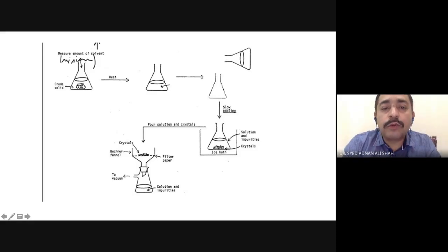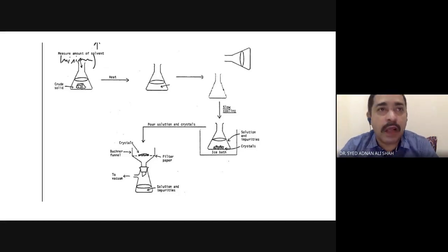So now this is how you can carry out the synthesis as well as the crystallization process, and the third one is recrystallization. Now the next step is to find out the yield, right? How much aspirin is formed from the salicylic acid. The amount of salicylic acid put in, according to this video, is about 2 point something.